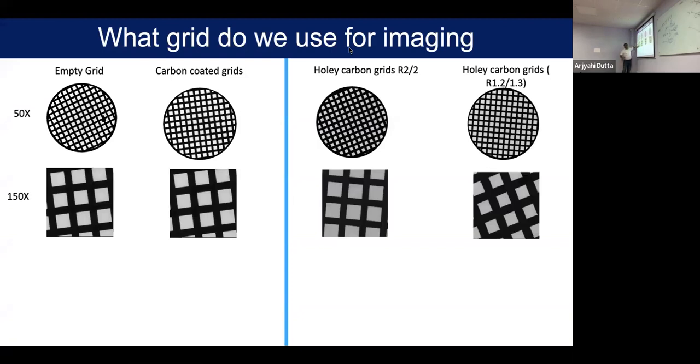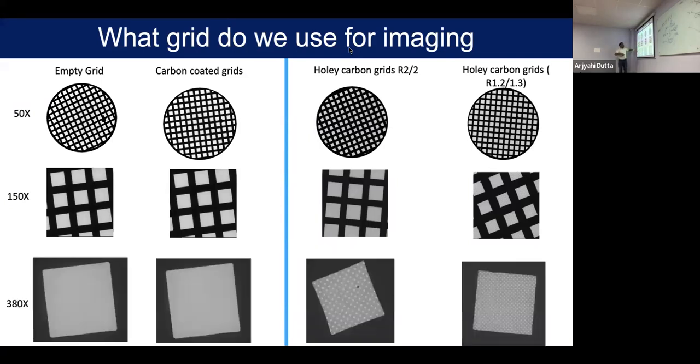And then on top, there is an amorphous carbon layer, because you need some platform where you can add the sample. If you look at this particular square, you can see there is a platform, you can add sample here, and then you can image it. It needs to be transparent, so you need that amorphous carbon layer, so your beam can transmit through that layer. If it is not transparent, it is going to block your sample. Generally, thickness will be only 15 to 20 nanometer, not more than that.